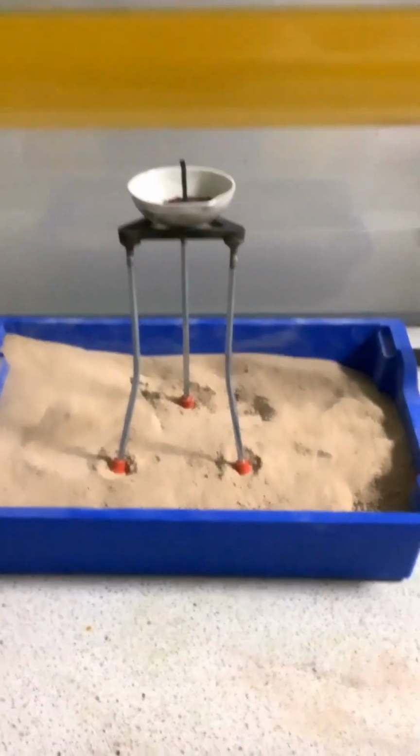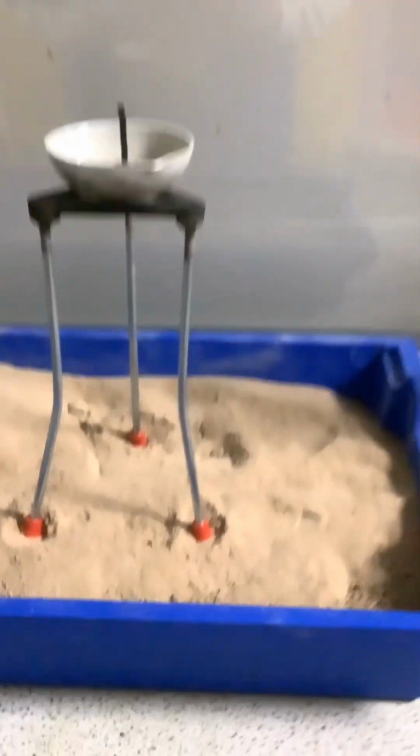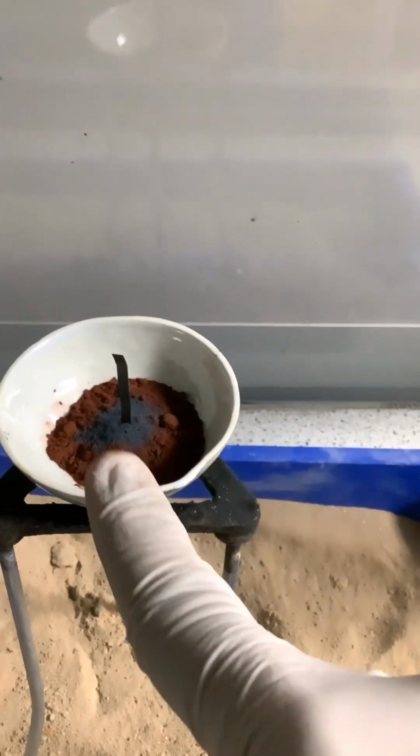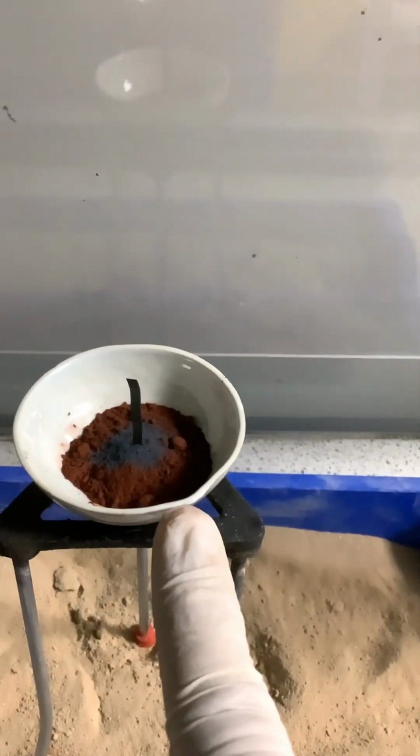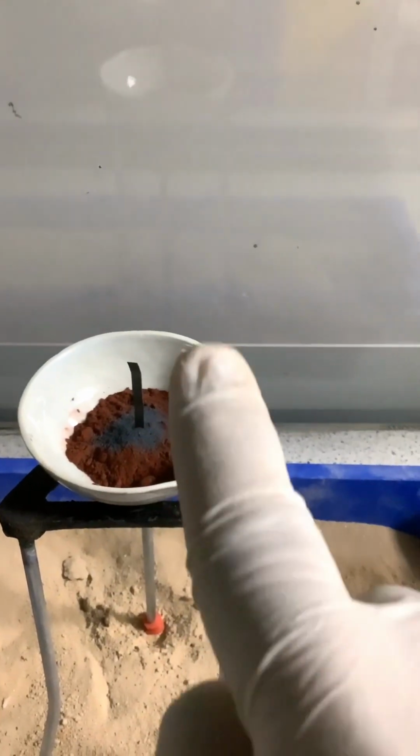The tripod stand is in its place, and instead of a crucible I have used an evaporating dish with the mixture on the top. So you can see there's a mixture of our iron oxide and aluminium in there. We have placed our magnesium ribbon in between like a tower, and I've just sprinkled magnesium powder around it. The grey color is the magnesium powder.